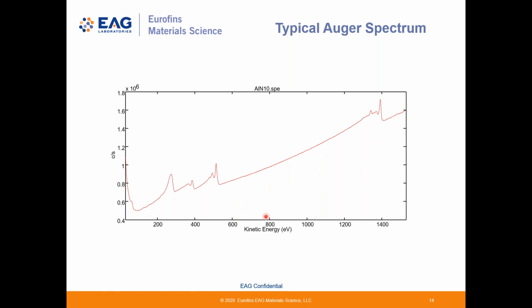You might see an energy resolution noted about 0.6% of the kinetic energy, so this increases with energy. Towards the lower part of the spectrum, it increases again due to the secondary cascade of electrons, a lot of which is suppressed by the CMA, but it's still there.